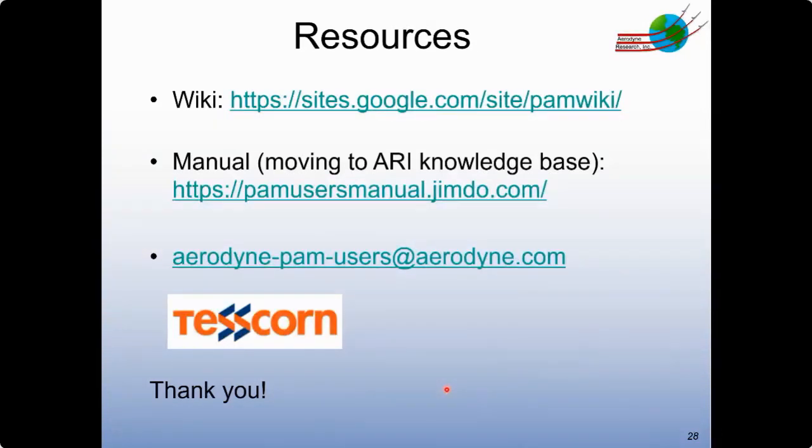That's a really good question. I know that in the earlier days of OFRs, when most of our users were based in the U.S. and in Europe, dust events were not really on our minds, and that was what led to one of the most prominent OFR users in the field, Professor Jose Jimenez at CU Boulder, even recommending that groups take off the front plate of OFRs when they can, for various technical reasons that I won't get into here. But they argued that it was advantageous to take the front plate off and just sample ambient air directly in without the front plate.